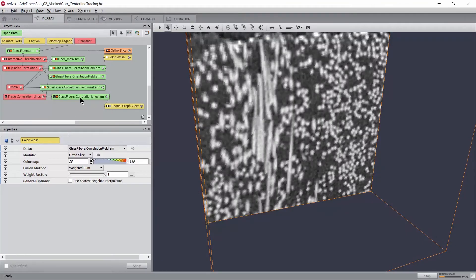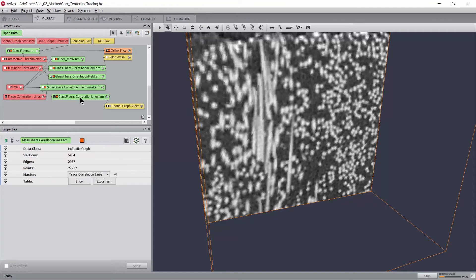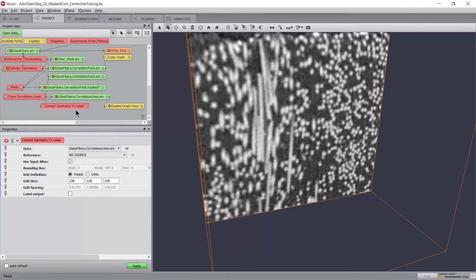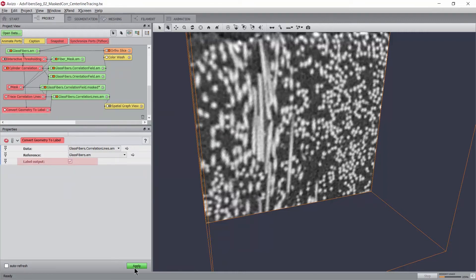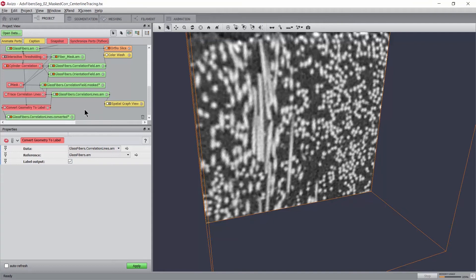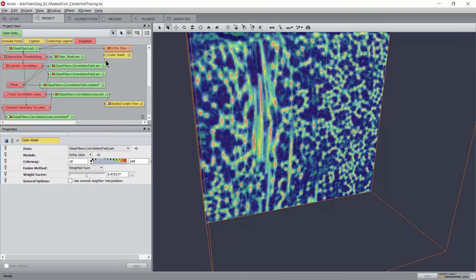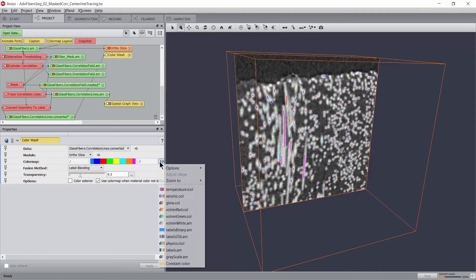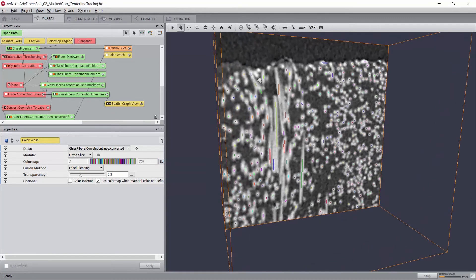In order to visually assess the quality of the tracing and also to fine-tune the previous parameters, a good practice is to convert the spatial graph representing the traced centerline into a voxel representation. This can be done using the module Convert Geometry to Label. By connecting the reference image, we will use the same image grid, bounding box, and voxel size to voxelize the spatial graph. We also select label output in order to assign the fiber ID as the label in the resulting image. We can then overlay the voxelized fiber centerlines onto an ortho slice using a color wash module, and examine precisely the result of the tracing. You may want to change the label color map to Label 256, so that there are fewer chances that neighboring fibers are given the same color.